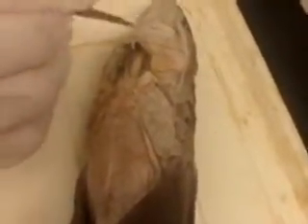The intermandibularis originates in the Meckel's cartilage, and it inserts in the midventral raphe, and it is homologous to the intermandibularis in the necturus. And the next is the levator hyomandibulae. Now, that's fine. And the levator hyomandibulae is near the mandible.